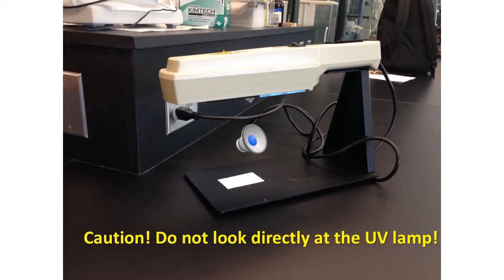In the second part of the lab, we are going to look at the UV absorption of different sunscreens by putting them on a TLC plate under UV light. This is what the UV lamp setup looks like. Notice that the lamp is pointed downwards in the setup. If for some reason you have to move this setup around, just be careful that the lamp is off when you do that. It's very dangerous to look directly at the UV lamp while it's on.